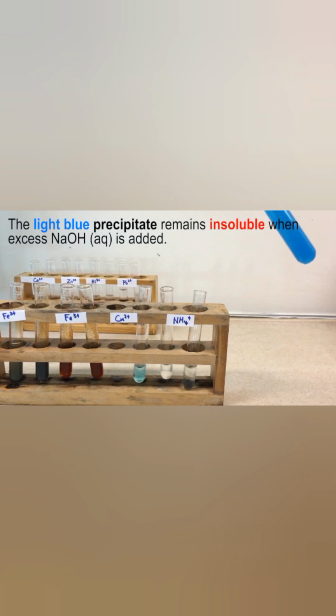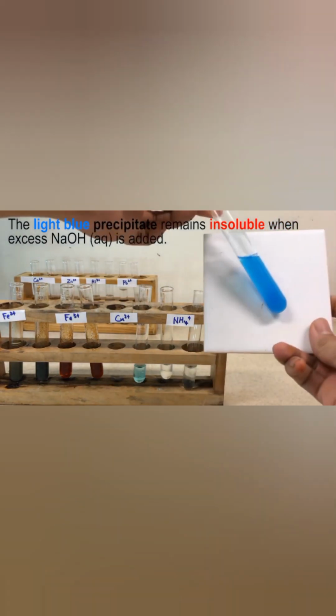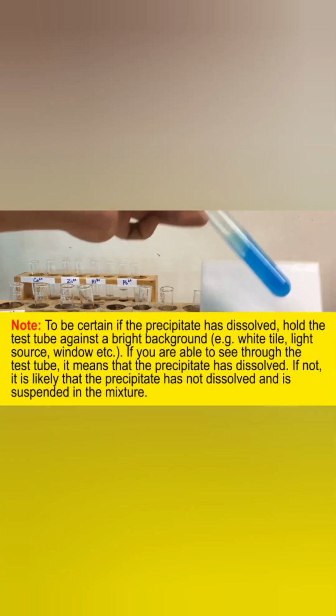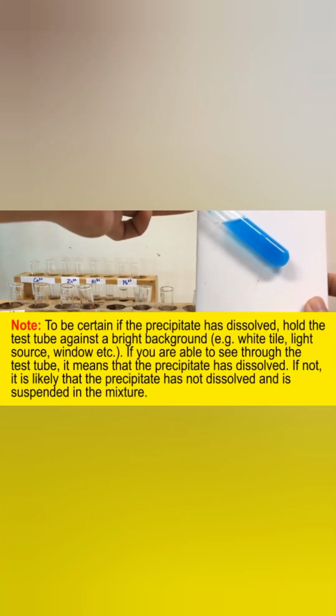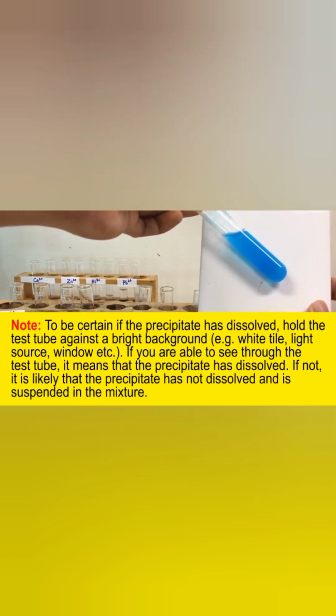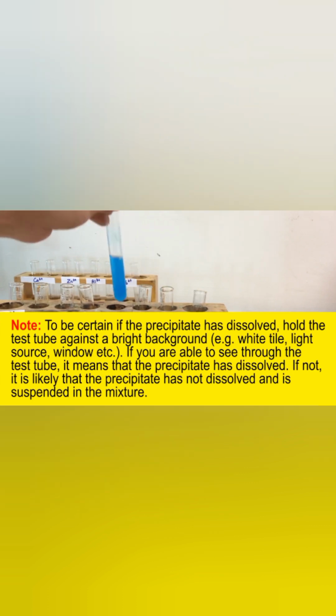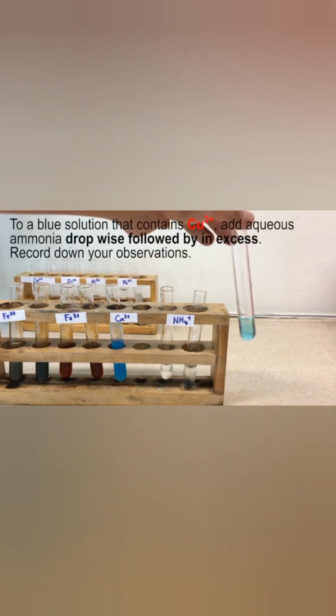But when sodium hydroxide is added in excess, the light blue precipitate remains insoluble. So if you want to still be certain, remember to hold the test tube against a bright background to be certain if the precipitate is remaining or is insoluble.